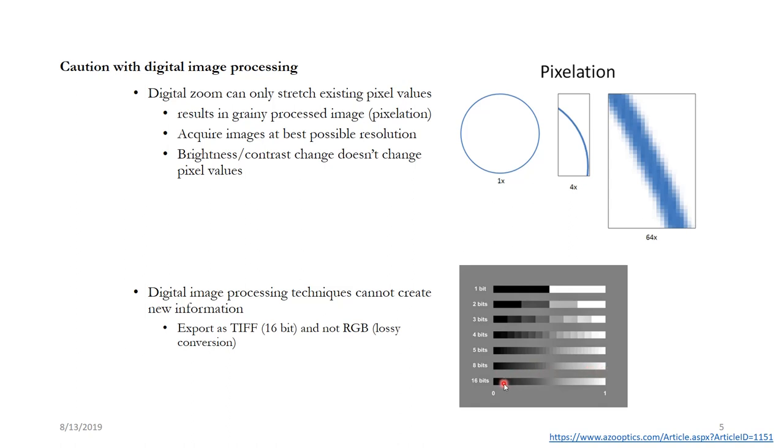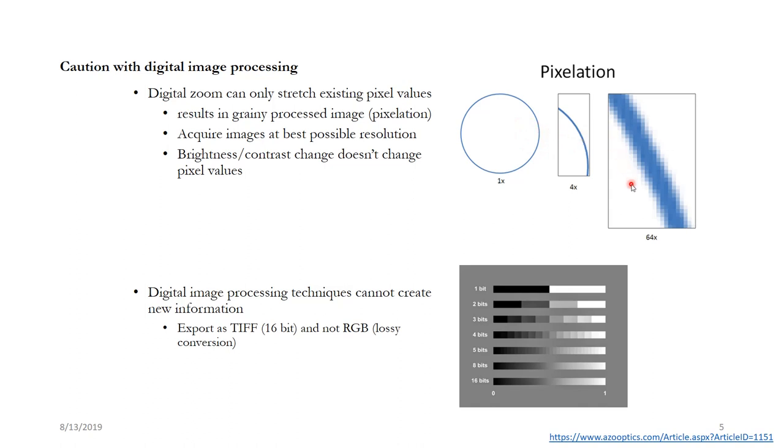So that means you have lost a lot of information while converting from here to here. And if you try to convert it back, that converting back is not going to create the original information. It will be just like this where you have some image and you are trying to stretch it in the intensity mode. So make sure that you always export as TIFF and do all the analysis in this mode only, not in the RGB mode.